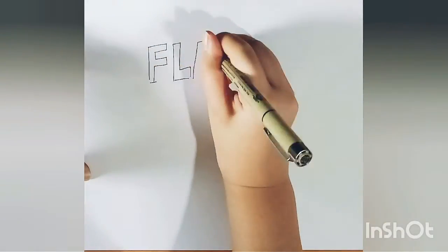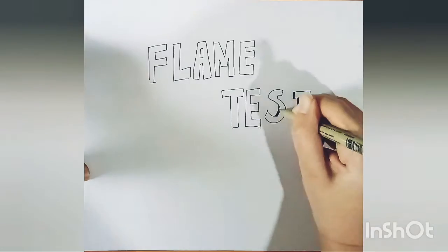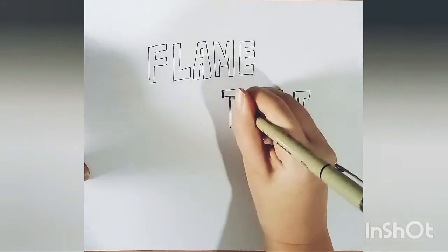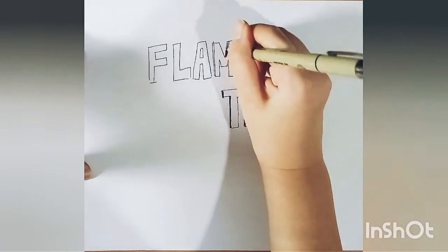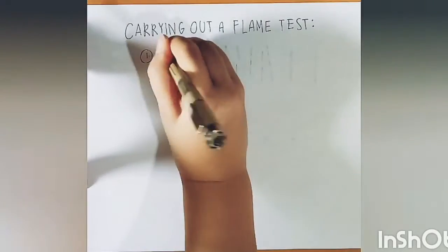A flame test is an analytic procedure used in chemistry to detect the presence of certain elements, primarily metal ions. It is based on each element's characteristic emission spectrum and the color in general, which also depends on the temperature of the flame produced.